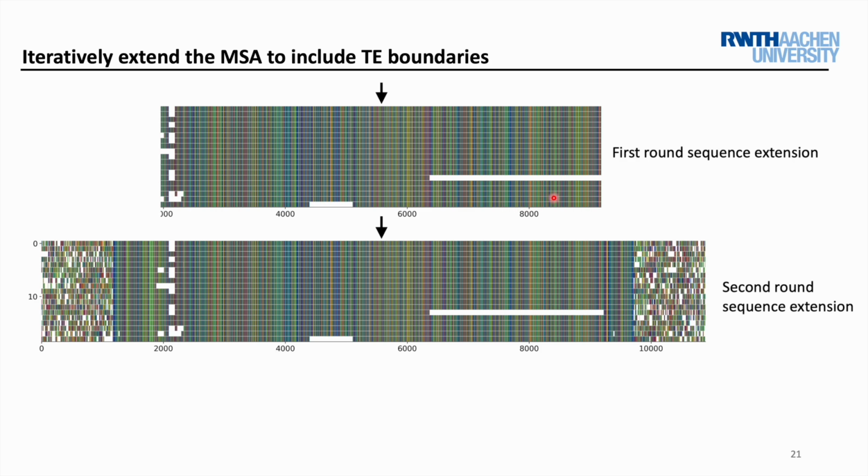First, after every round of extension, you have to align all the sequences to check if this round of extension is sufficient, which means it can cover the boundary of the transposable elements. Because in manual curation, the multiple sequence alignment is very computational resource intensive, this can take a long time. Think about it.